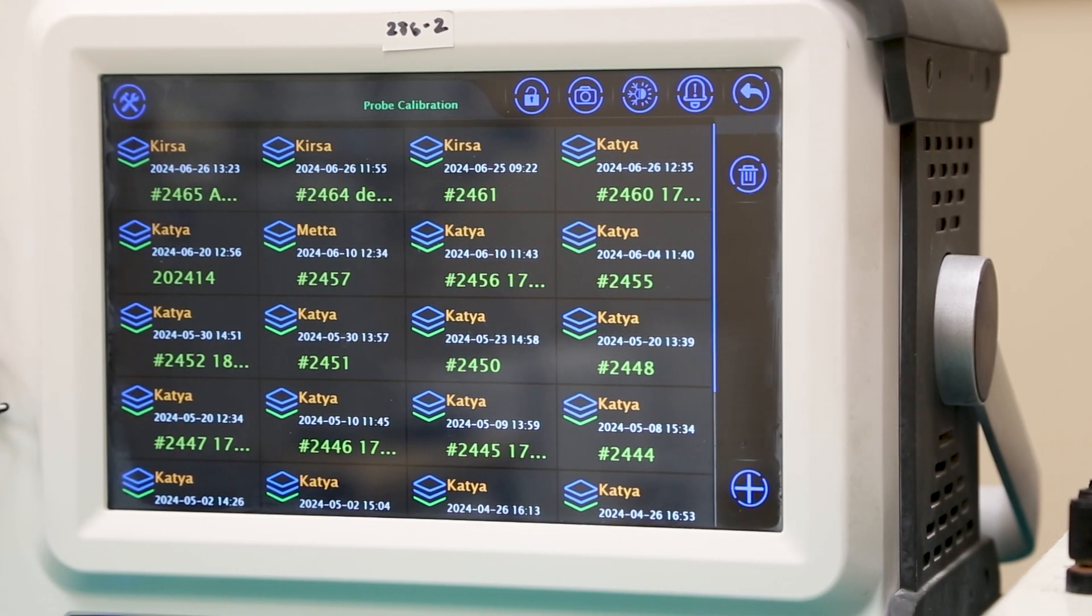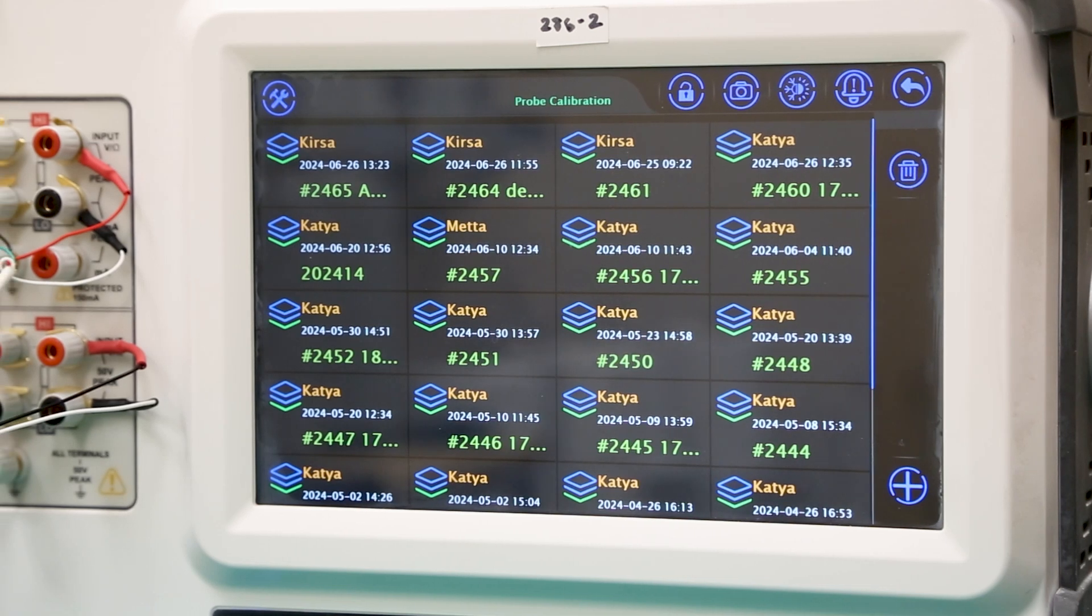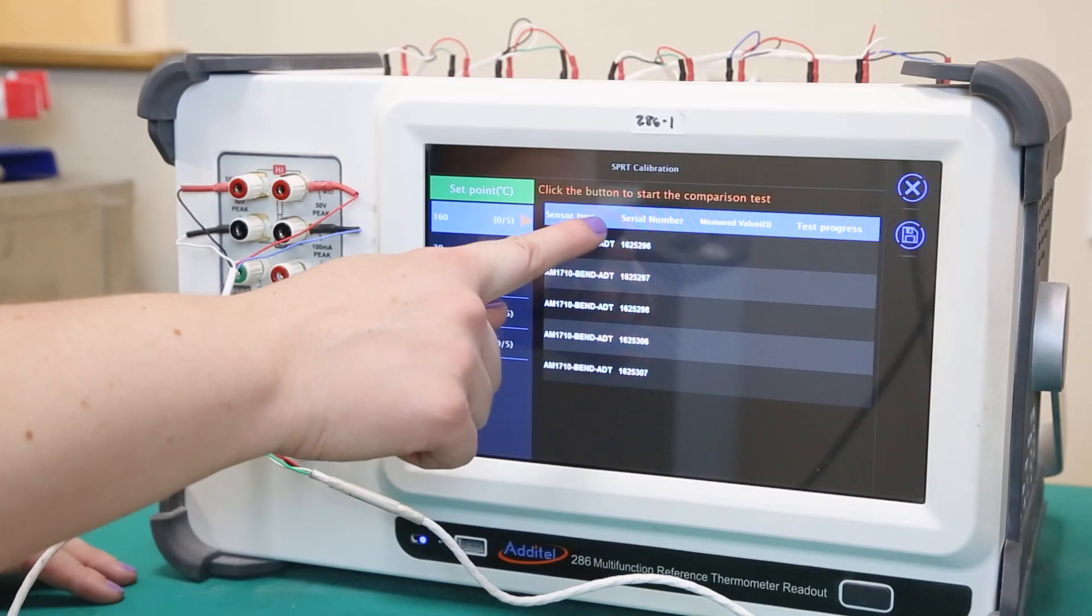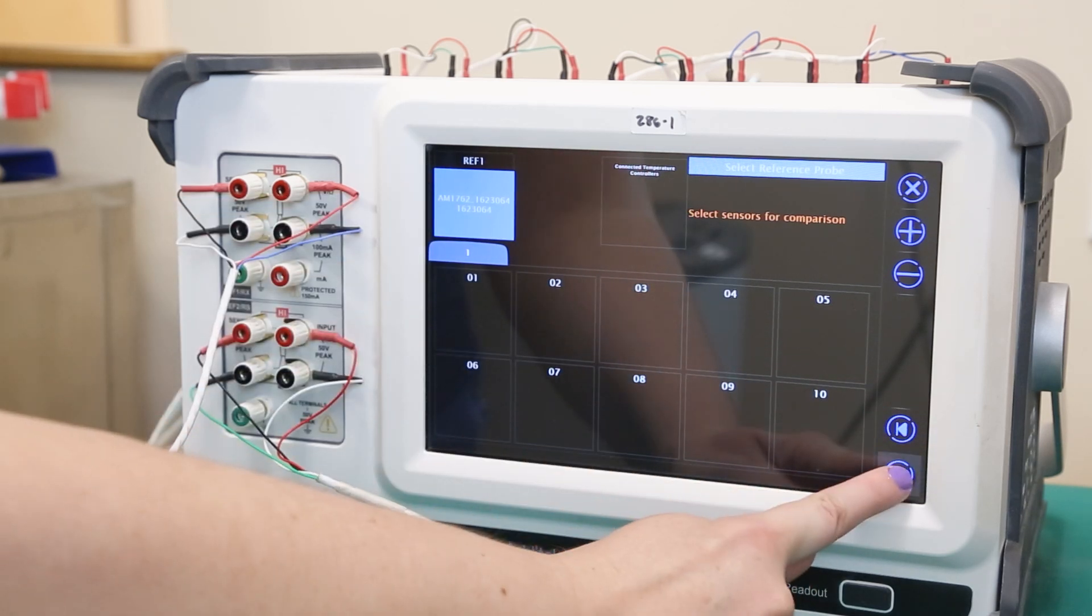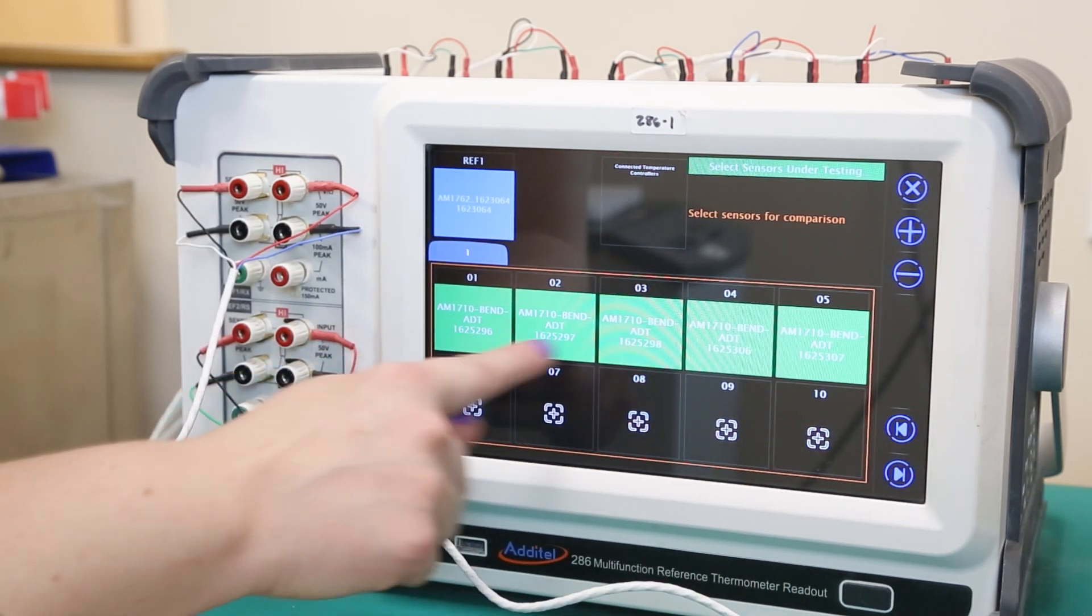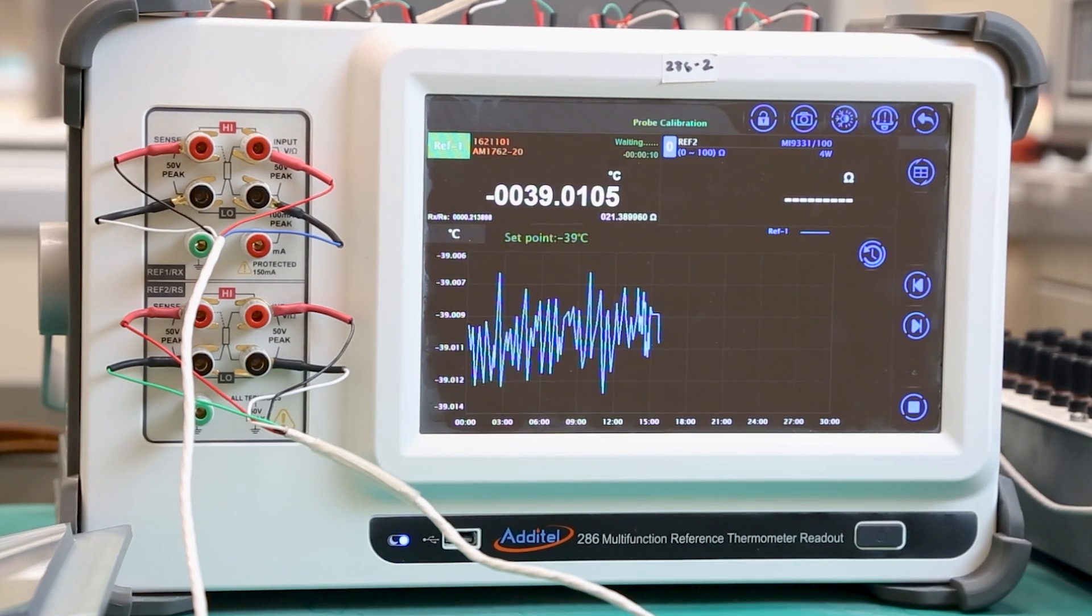The calibration program will also be stored on the Adytel 286 to be repeated at any time in the future, improving lab efficiency and reducing downtime. Programs like the ones shown in this demonstration are fully customizable, to fit any lab's testing procedures and standards. We hope this has been an informative look at how a temperature calibration can be done with the 286.